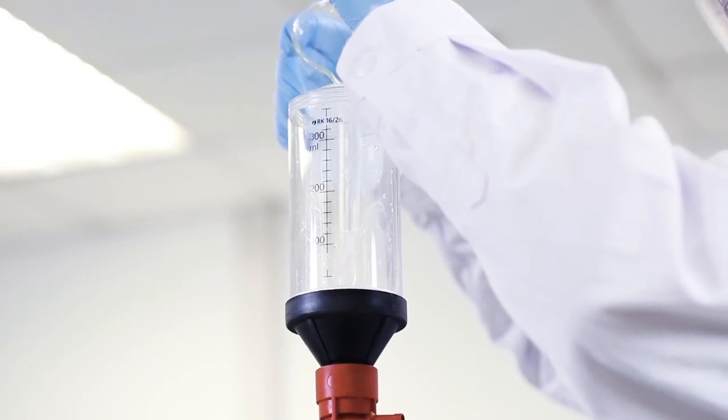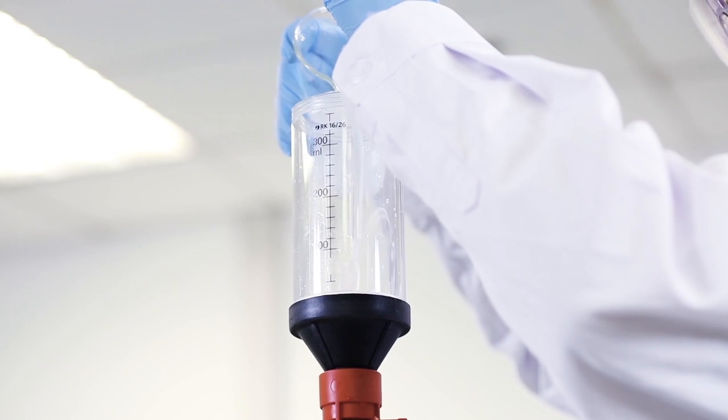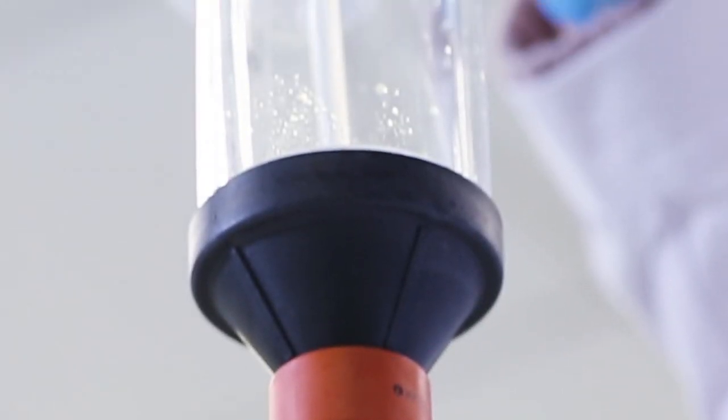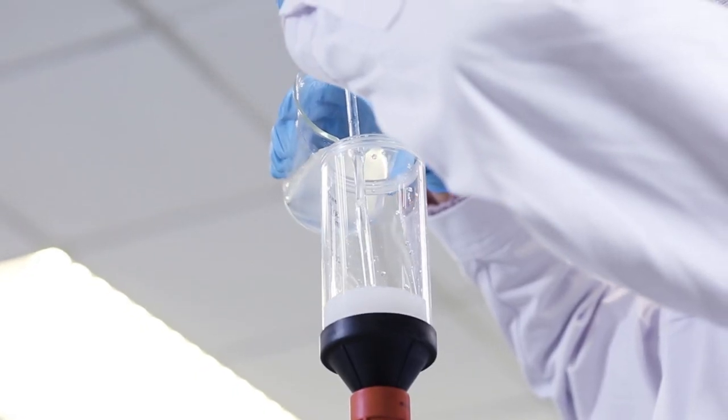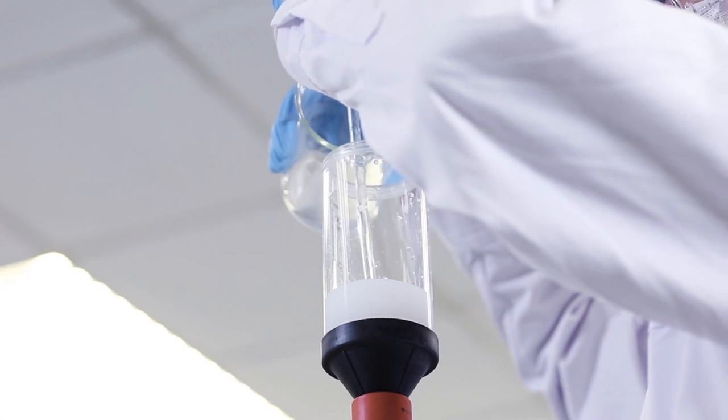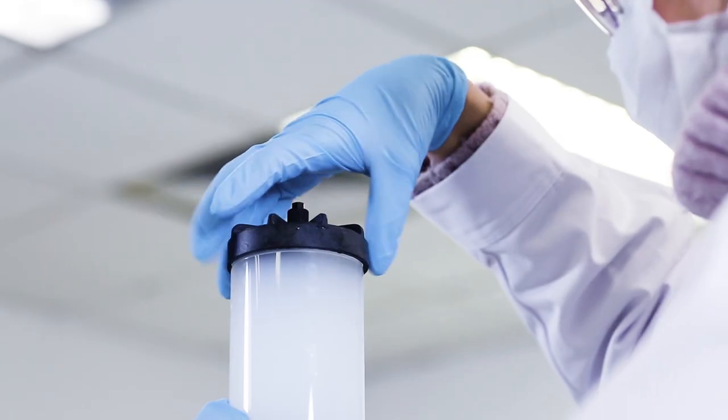Pour the slurry down a glass rod or spatula held against the wall of the column. This will minimize formation of air bubbles. It is crucial to pour all the resin at once without stopping. Add additional packing solution if the slurry does not reach the top.